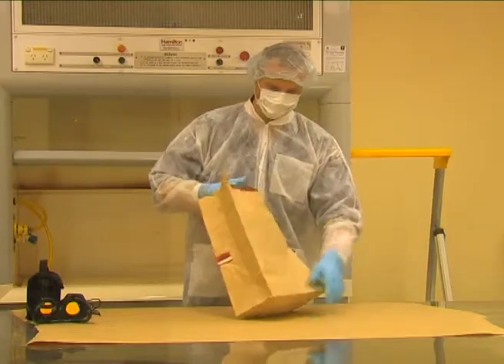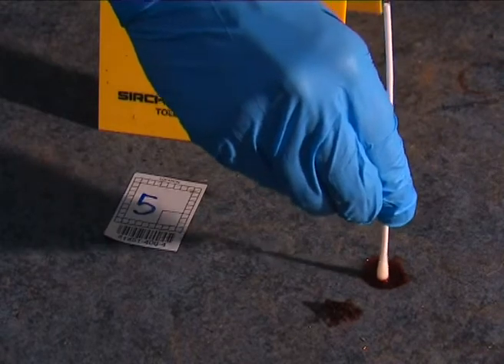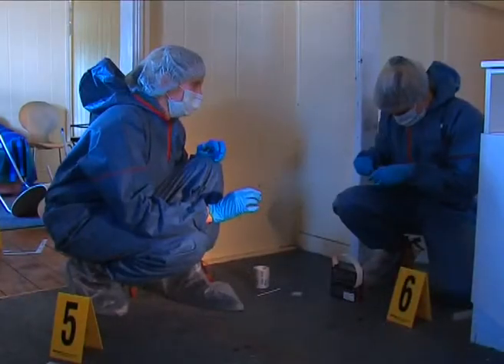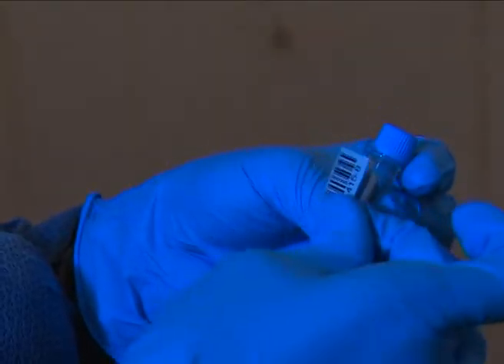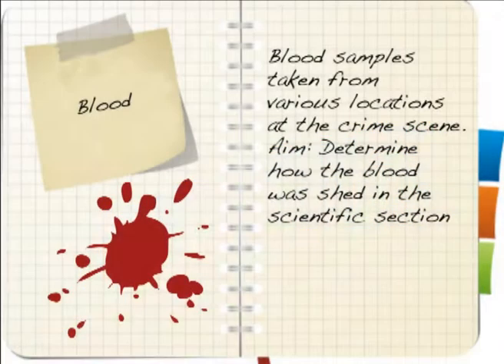Next, I'm off to visit the scientific section. The blood DNA samples have been sent to Queensland Health for analysis, so I'm going to investigate some of the other procedures that can be carried out while the blood work DNA analysis is being processed.